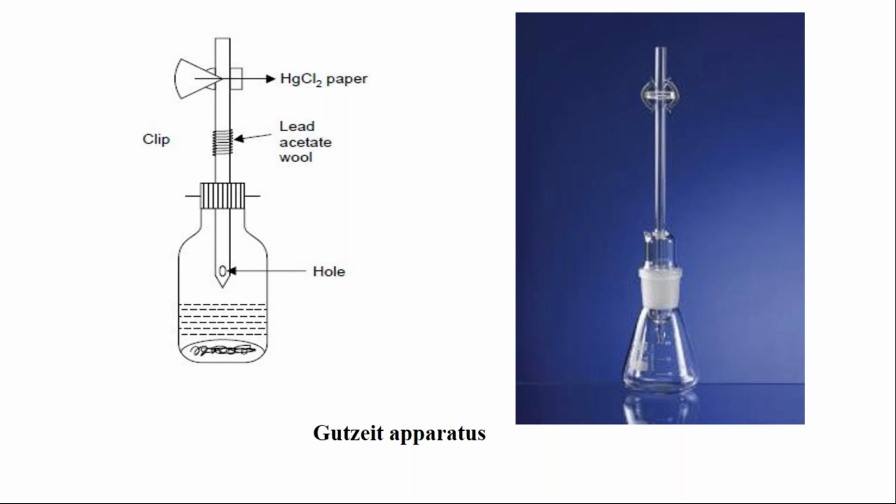They had not shown it in that animation. But here in this diagram, you can see there is a hole, and that hole is 2 mm in diameter. It should not be less than 2 mm.